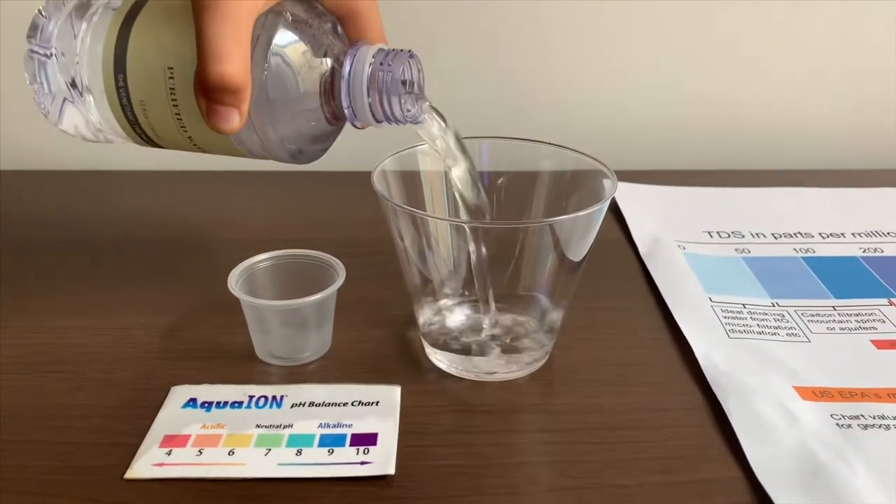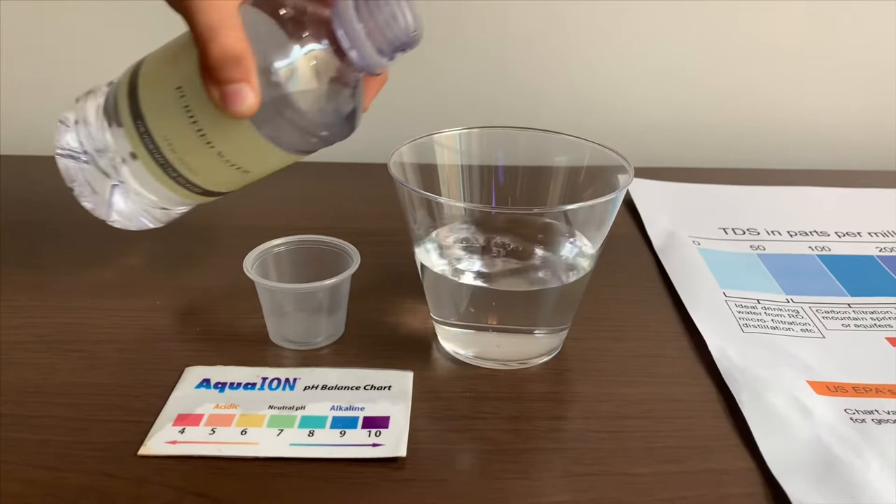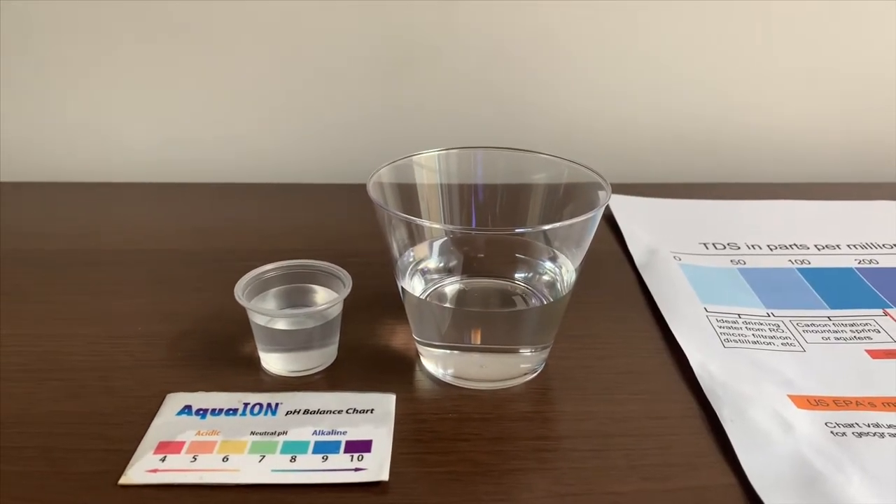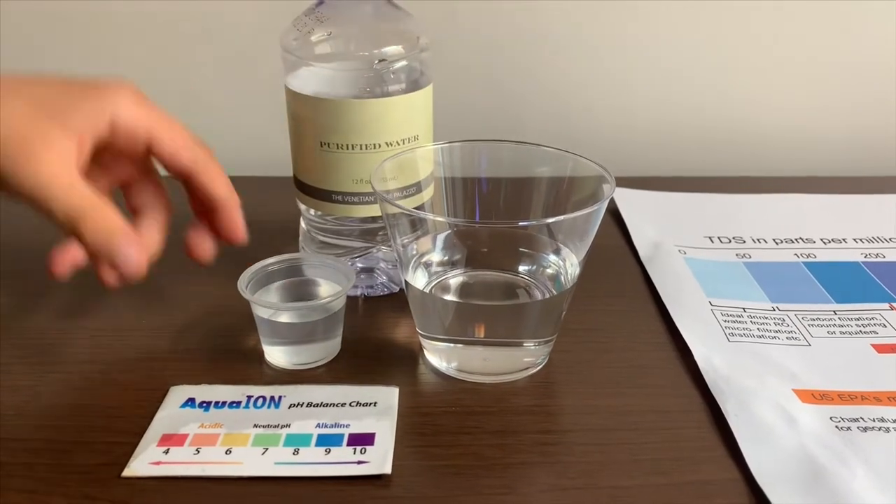Let's pour some water in. This is a little too much for the pH cup, so let's pour some back into the TDS container.